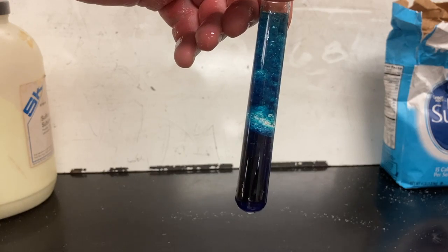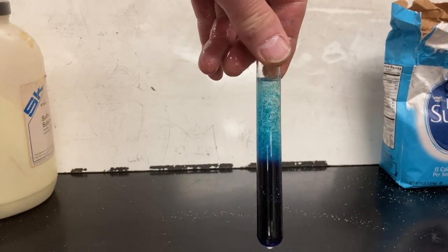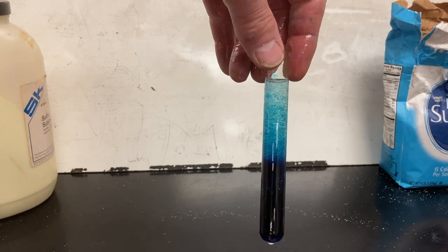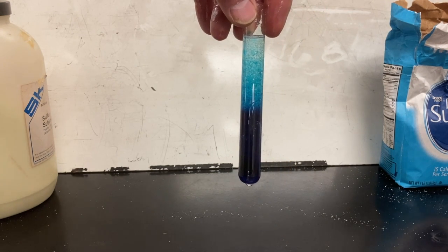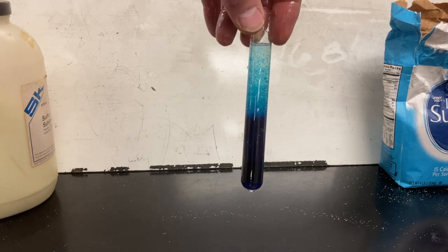I'm speeding it up here so that you don't have to wait as long as I did. And even after waiting, in fact more after waiting, it seems that there are two distinct layers for the different substances. So the oil and the water make two different layers.